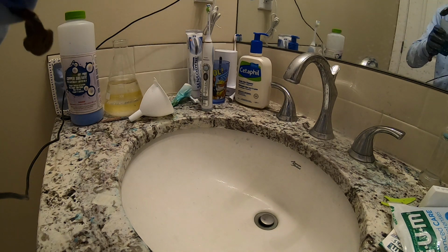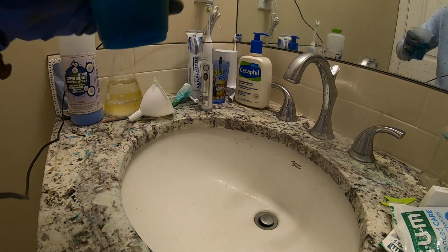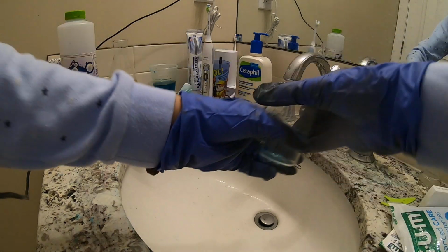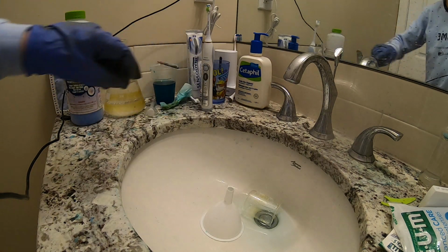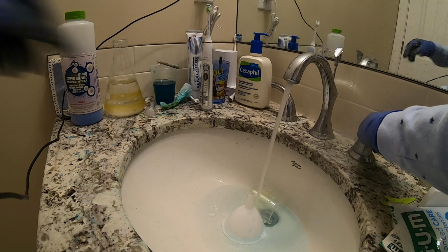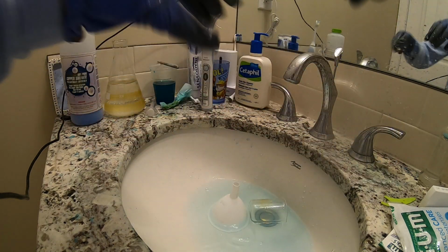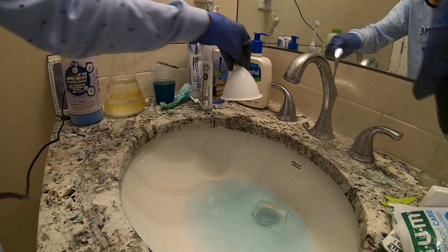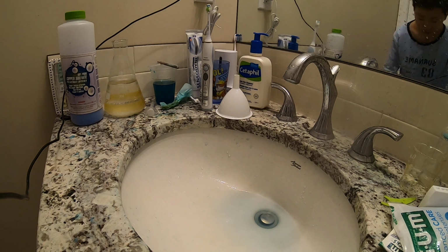So, give that a good rinse. And then add some more water to dissolve as much as I can. Throw that there, because that's not needed anymore. Wash this. I'm going to just do that. Throw everything in there that needs to be washed. Clean the sides. It's good to clean stuff when you finish working with this. So that's clean. That's clean. And that can be let through. So I'm going to take off my gloves and I'll get to my explanation.